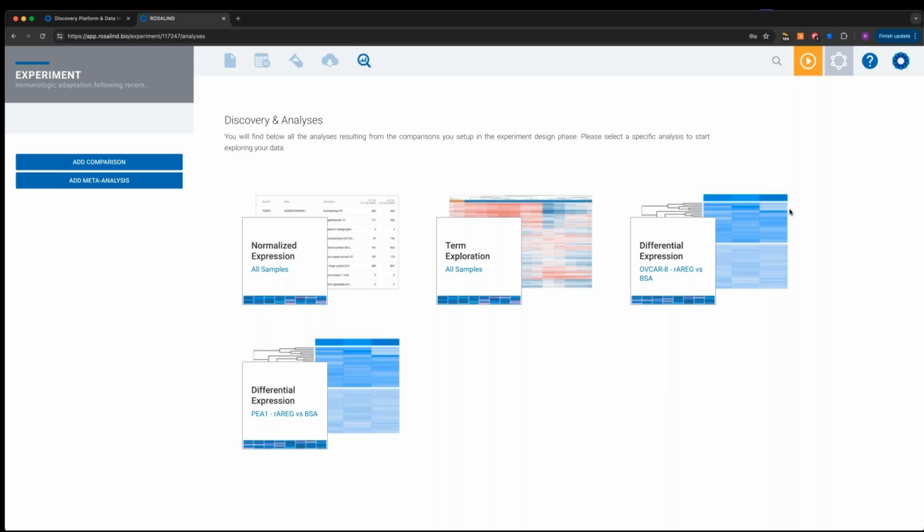So no longer will you have an option effectively of being able to see things grouped by knowledge base or see things grouped by biology. So the biological representation is coming soon. The knowledge bases will be updated, and the speed with which enrichment is performed is going to be radically accelerated.